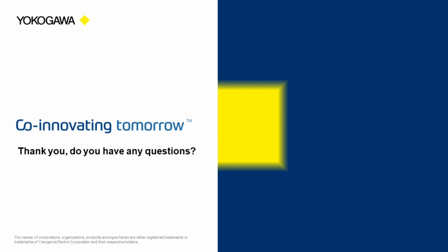In terms of the amount of picking that you can get done on one day for an experiment, I would say about 60 to 70. If you use the machine learning algorithms on the SS2000 to autonomously detect and pick up the cells, you could leave it going for longer without much user input, and potentially increase your throughput that way.